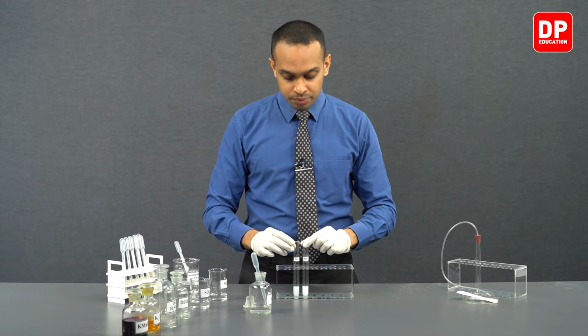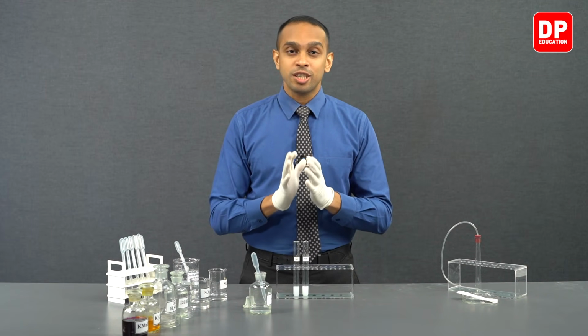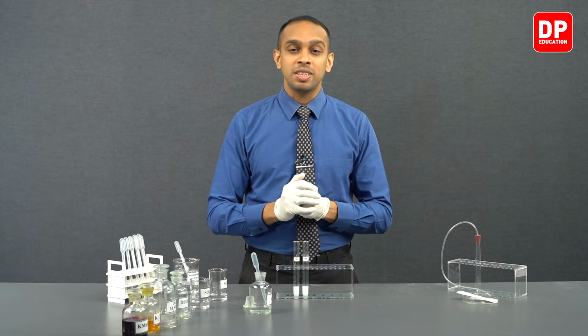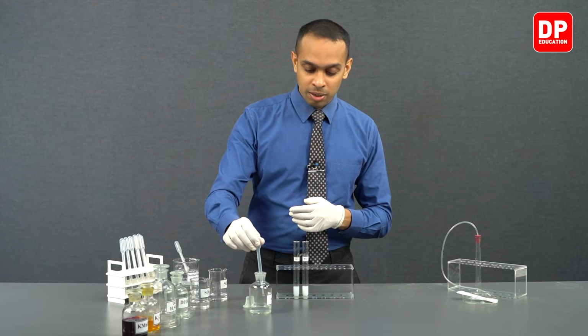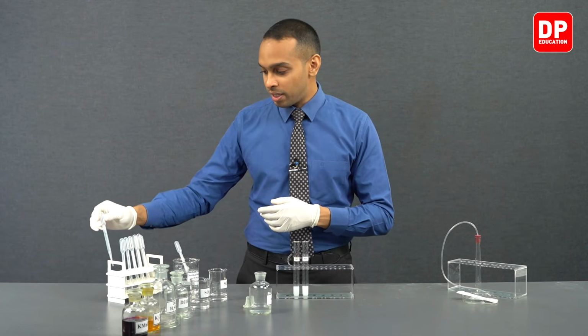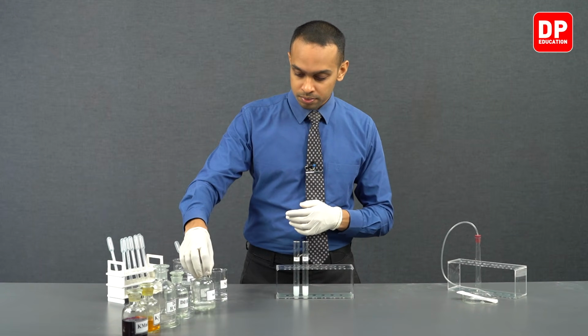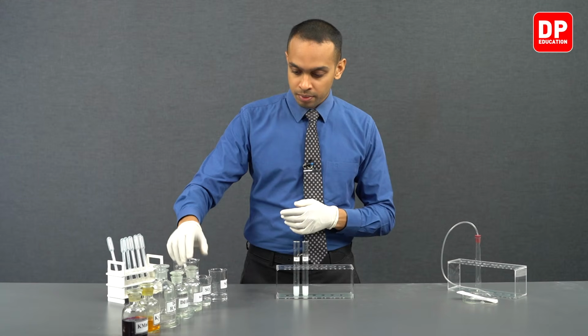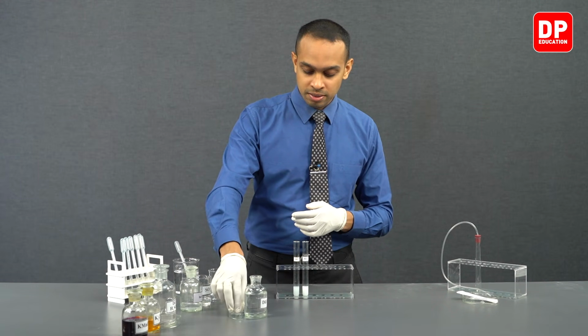Now students, we can move on to adding a little bit of HCl to each of these precipitates we have formed here to observe whether these precipitates dissolve in the presence of HCl. So let's keep our barium chloride aside, and let's take the HCl that we have over here.